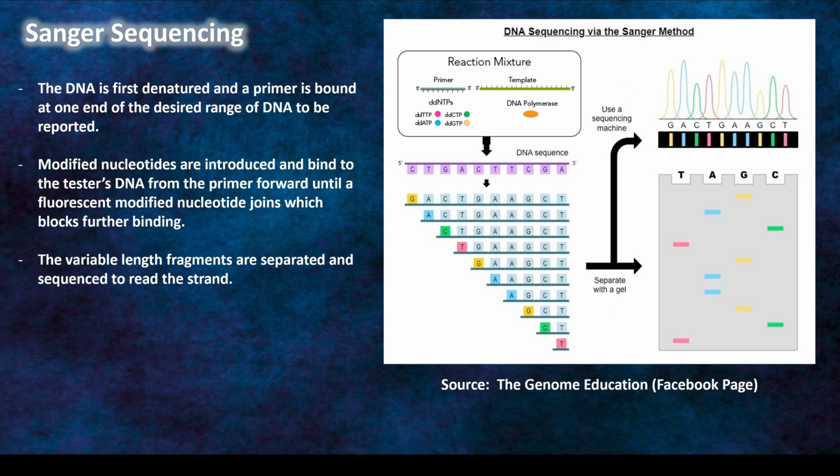This can read them through other methods, but it's not good at targeting those. It's better if you can create a primer for a known section of DNA and then go look and see what mutations exist there. So again, it's very good if you want to target a particular section and look at whether there's a mutation there. Not so good if you're trying to read the entire whole genome of someone because it's time-consuming, expensive, and a little difficult to map together.